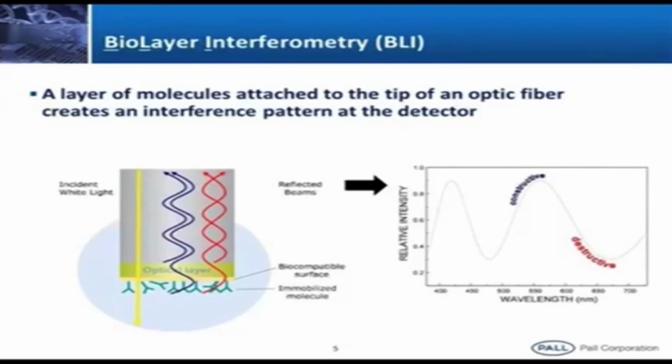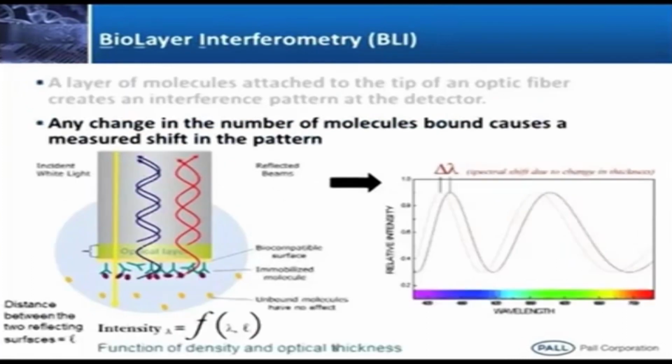One light which goes through the ligand meets an obstacle due to your ligands, and once again light gets reflected back. Constructive interference makes the signal rise, destructive interference makes the signal drop. Suppose I dip the same sensor into the corresponding binding partner. I am giving an example. Here I am coating a sensor with a Protein A matrix. Protein A has a strong interaction with a monoclonal antibody.